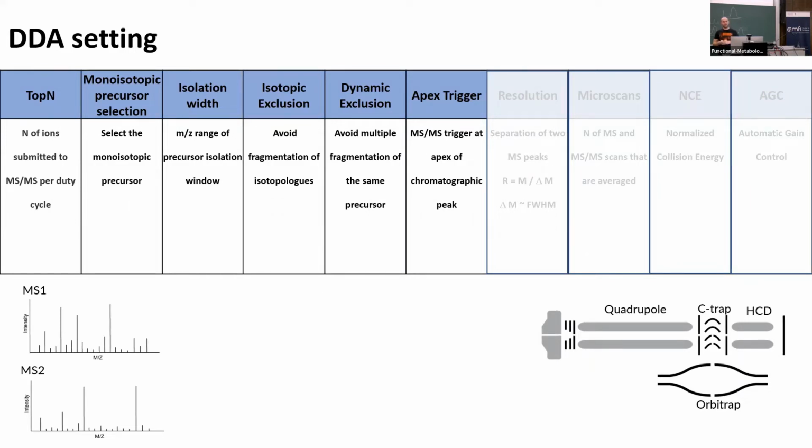It's basically you can set a time range at which this apex needs to be, otherwise it triggers the scan. So there's a little fine tuning needed, but in my experience, it's been worth it.